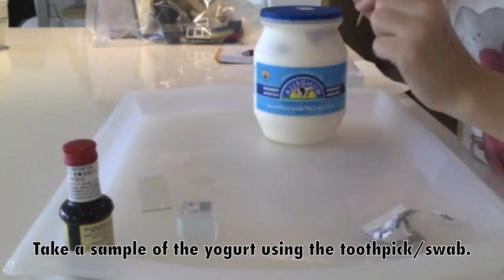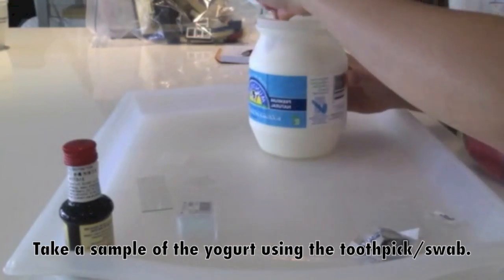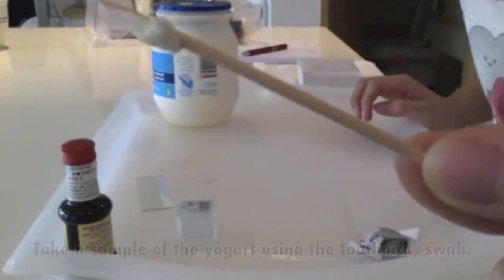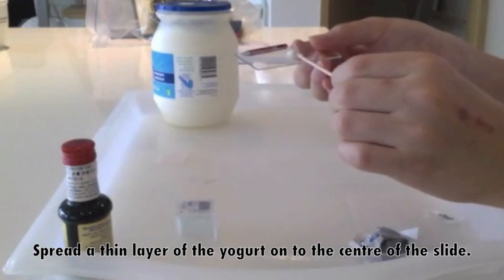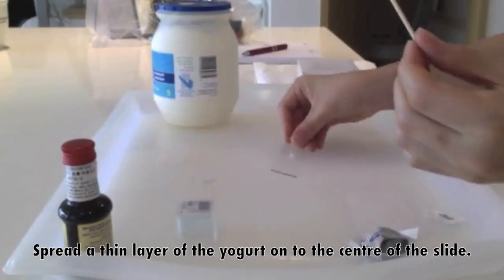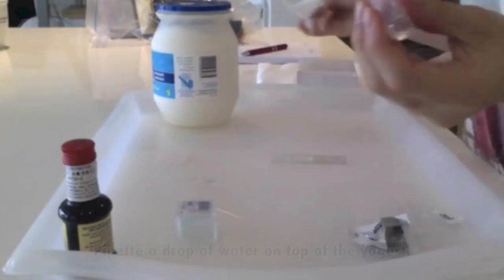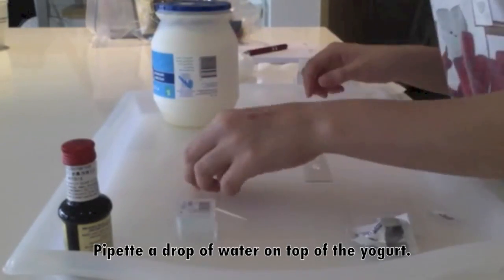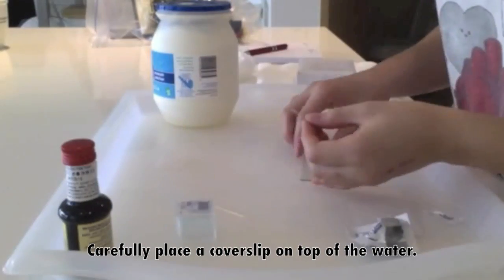Here is the procedure on how to prepare the slides. First, use your toothpick or other swab to take a sample of the yogurt. Then, spread a thin layer of the yogurt onto the center of the slide. Then, pipette a drop of water onto the top of the yogurt. Finally, place a cover slip on top of the water.